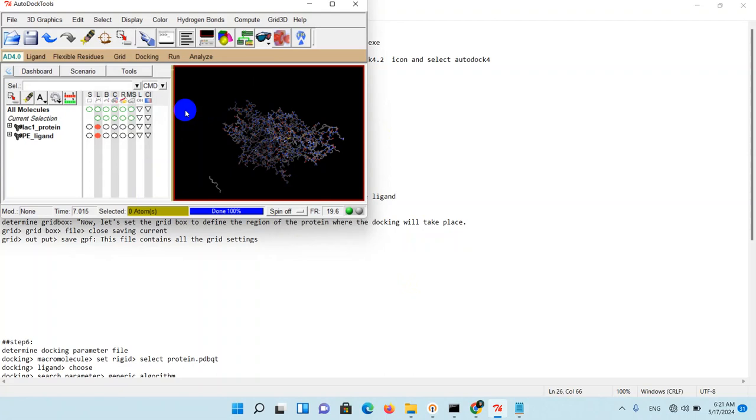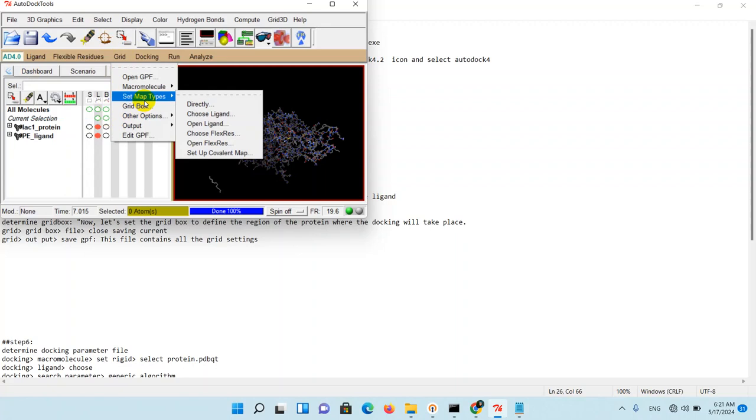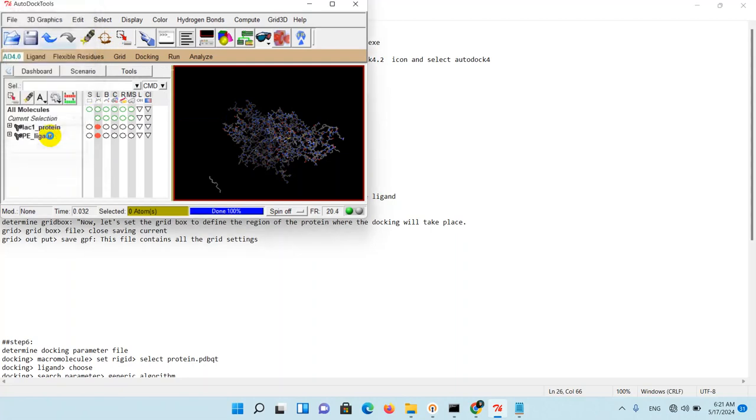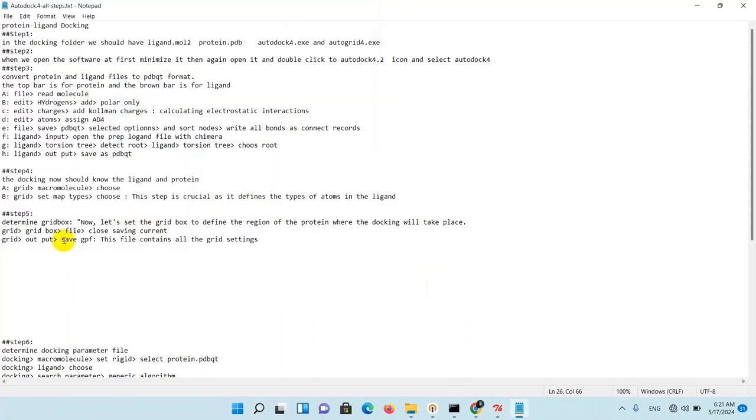Then go to Grid again and go to Set Map Types and choose your ligand. My ligand here is PE ligand. Select ligand, and now both of them are selected.